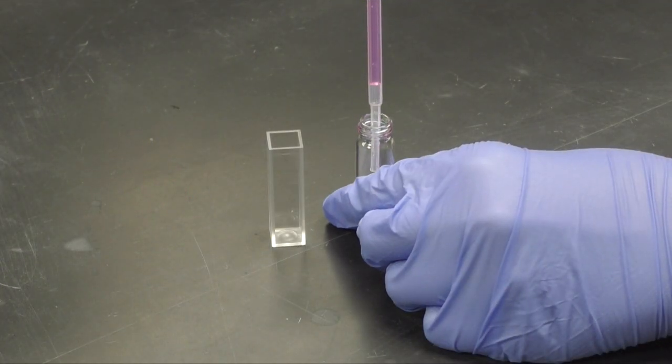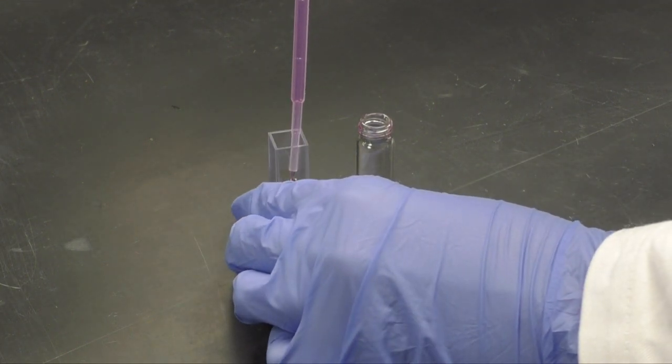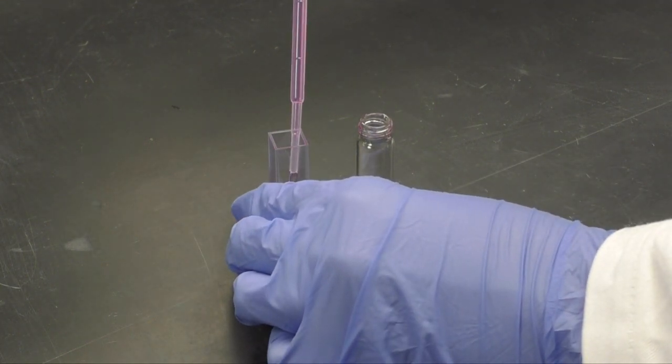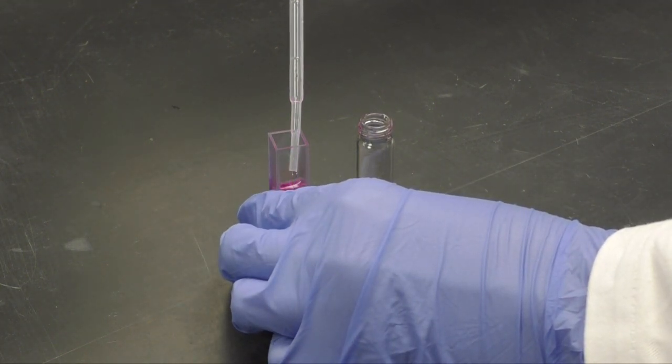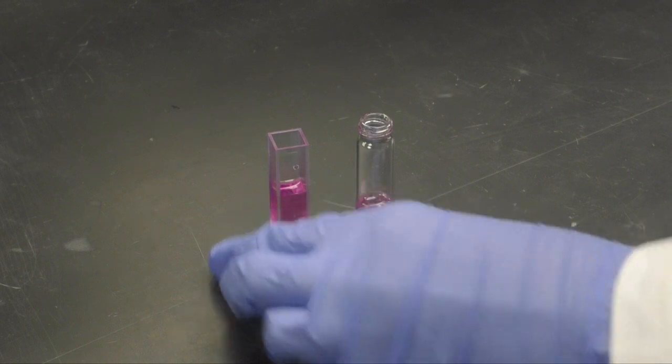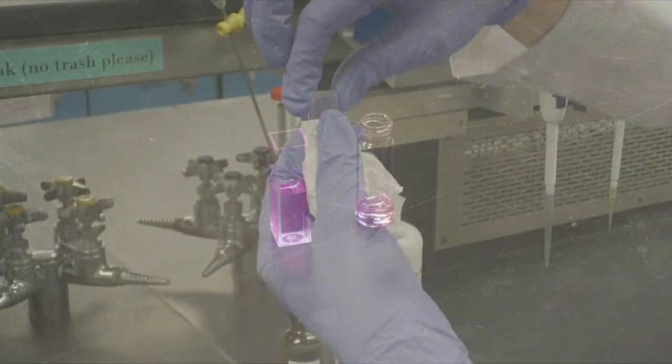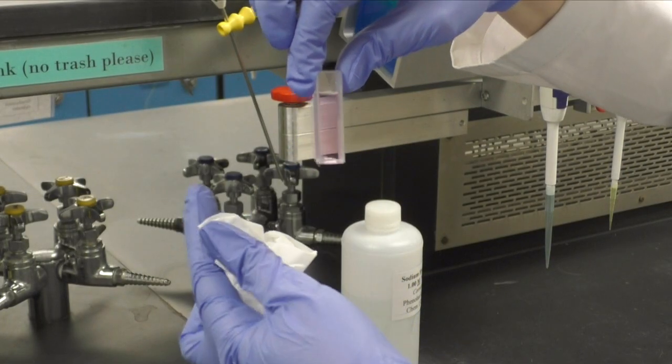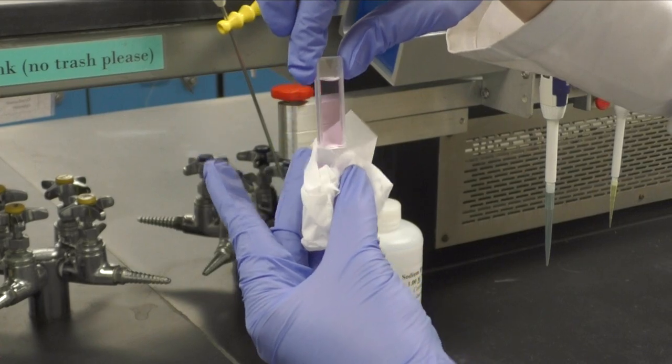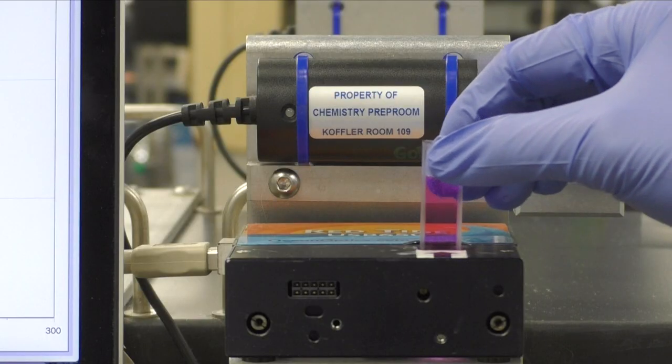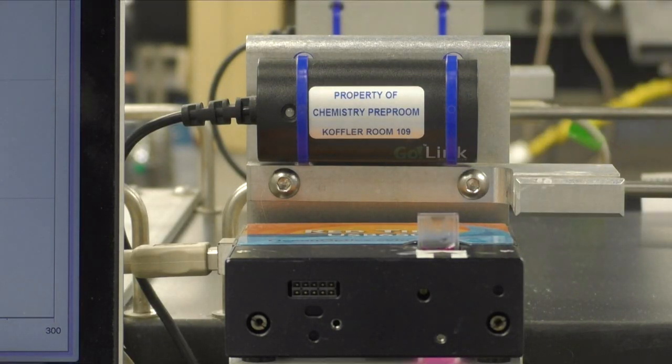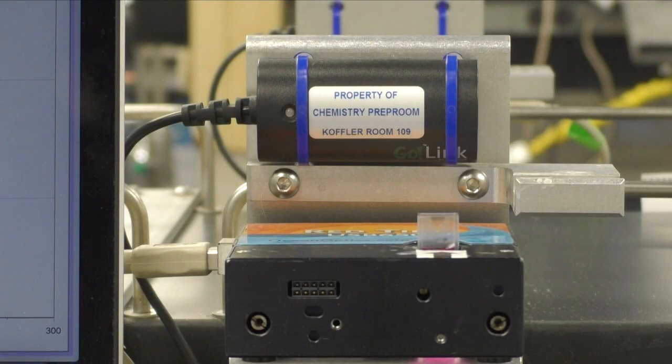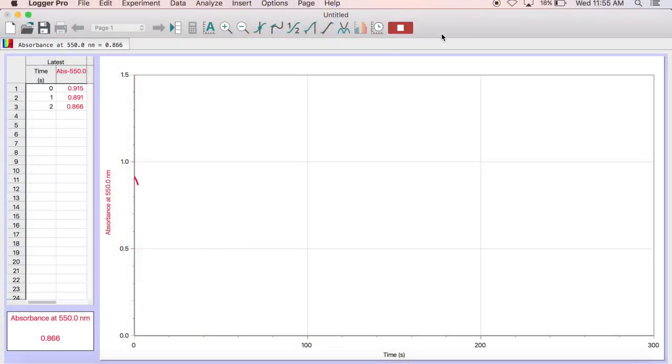Next use a transfer pipette to fill a clean cuvette about 2 thirds full with the reaction mixture. You need to move quickly as the reaction is very time sensitive. Wipe off the exterior of the cuvette with a kimwipe and then place it into the spectrometer with the arrow facing forward. In Logger Pro, press the green collect button and let the reaction run for the designated amount of time.